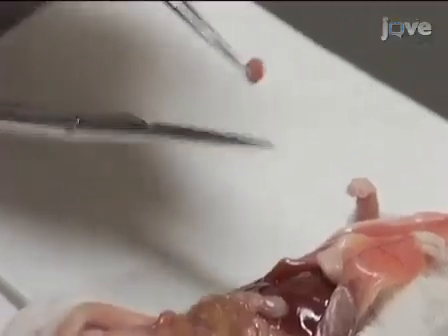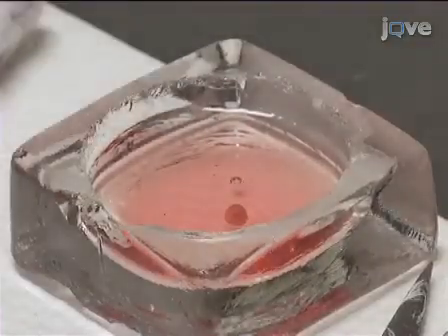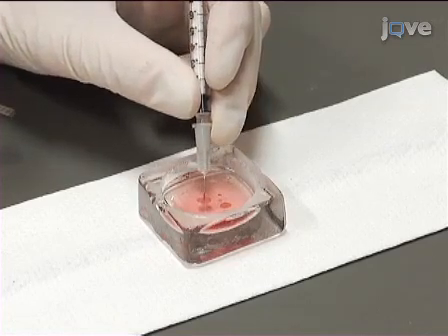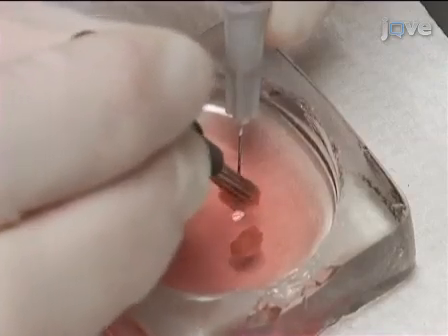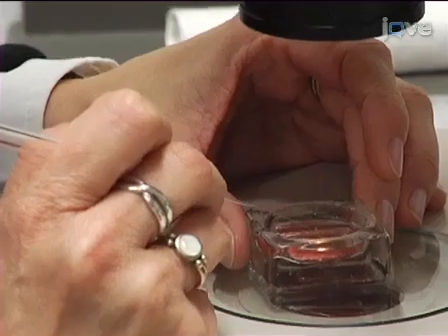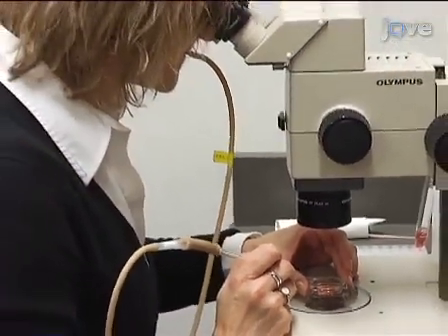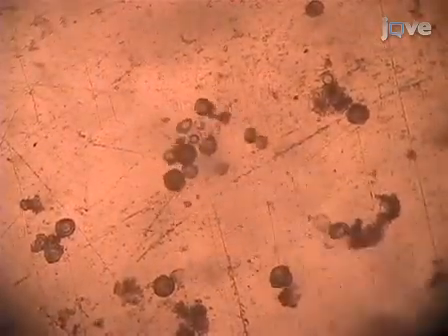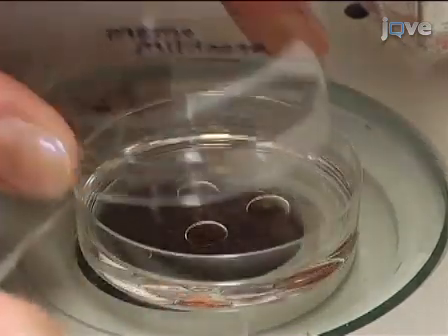Sacrifice the mouse, dissect the ovaries, and place them into a watch glass containing pre-warmed collection medium. Using a 1 ml insulin syringe, anchor the ovaries to the dish and release the antral follicles by puncturing them several times with 27-gauge needles that are fastened together. Under a dissection microscope, collect cumulus oocyte complexes using a mouth-operated glass pipette. Only collect large antral follicles and not the smaller pre-antral follicles or denuded oocytes.